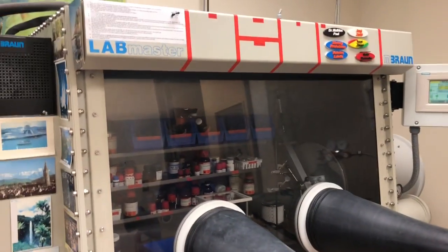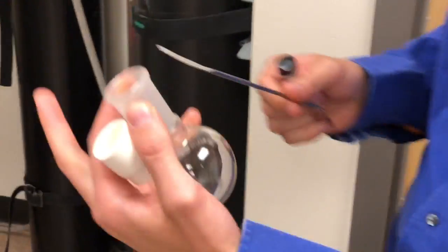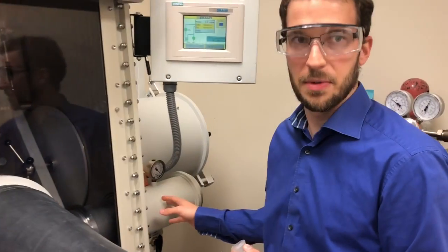Today I want to show you how to use the glove box in our group. We want to bring in a chemical and fill it up in a round bottom flask. We'll use the small chamber for that.